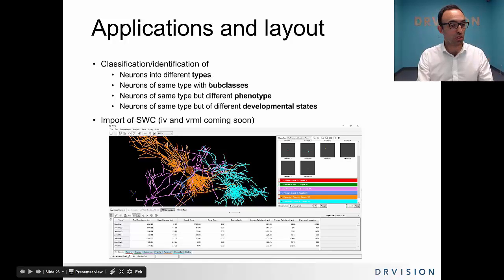In the near future, probably in 2 or 3 weeks, we will do another presentation where we will be focusing on how we are doing the machine learning, what kind of machine learning algorithm we've used, how it differs from others, and the benefits of using it. But you're very welcome to start testing the classifiers that we've created.